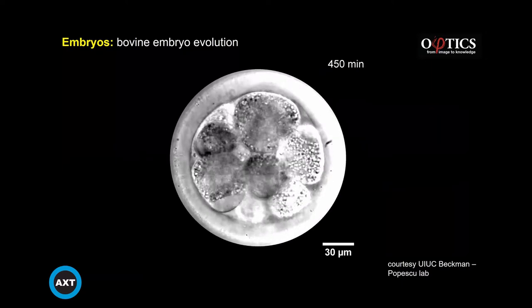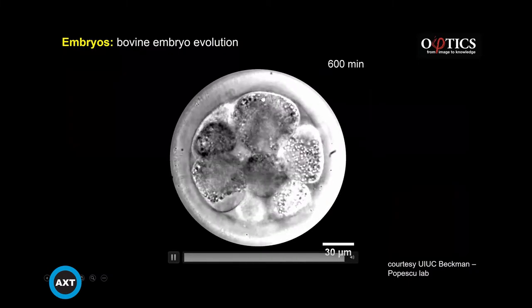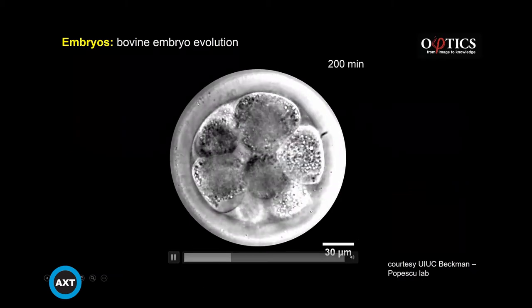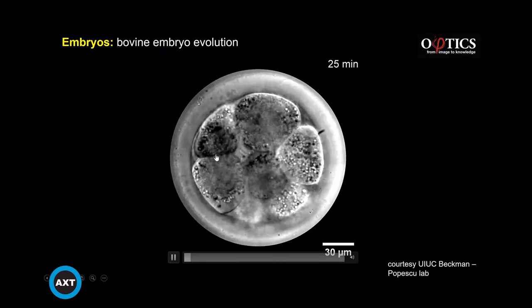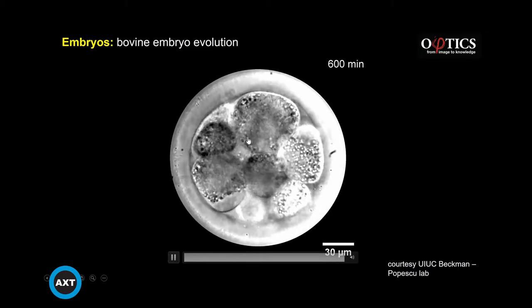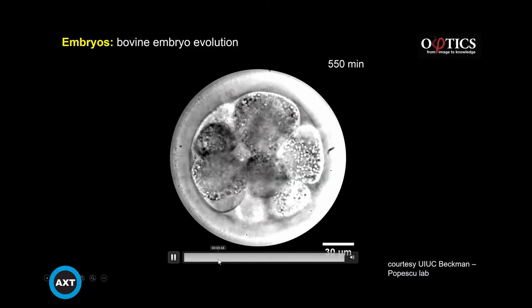Moving on to larger sizes, embryos, this is where GLIM excels. In this case, for example, it's a bovine embryo, one of the thickest embryos in nature. They're chock full of lipid droplets, and in a typical phase contrast or DIC image, this will be just one giant blob. GLIM allows you to image inside the embryo, even though you have multiple scattering centers, and get a view of the fate of the embryo itself.